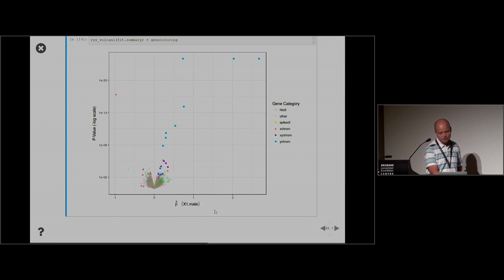The x-axis is the fold change, yeah? So since everything is below 0.5, there's nothing different. I mean, it's the same or similar presentation of the volcano plot for the RNA expression analysis, right? And so the outcome of your RUV method seems to shrink everything to the middle.